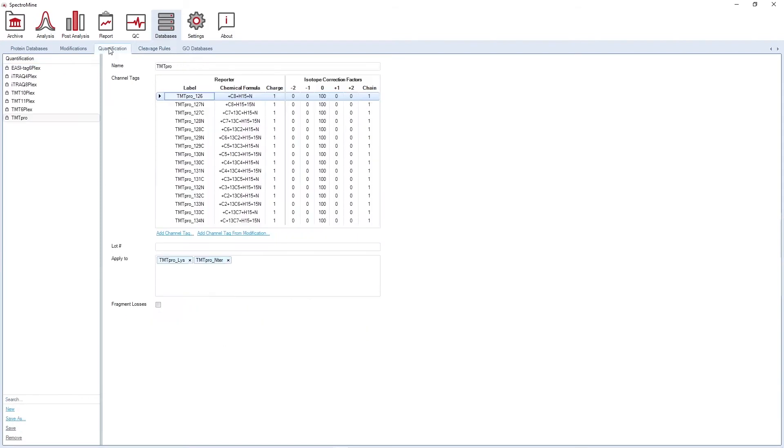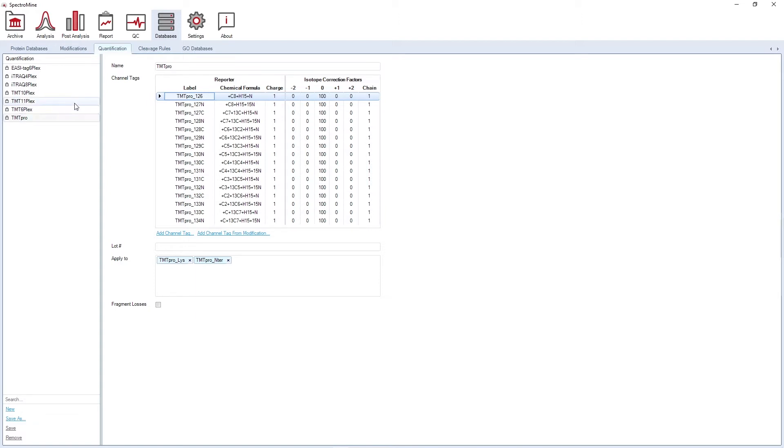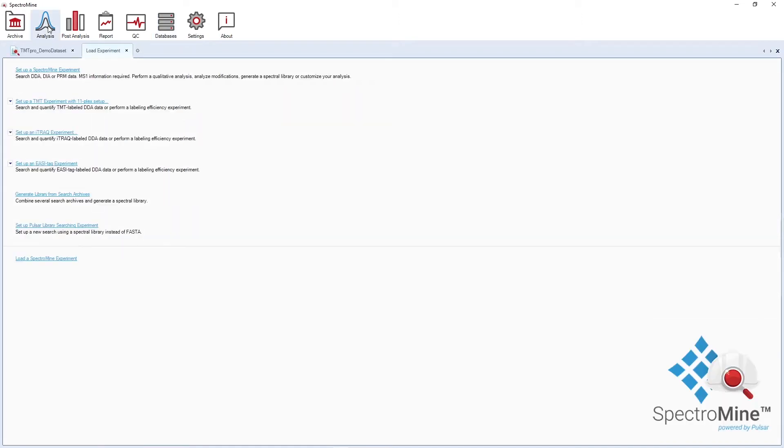Under the quantification tab, you can visualize the quantification method for ILQ quantification. Once you are all set with your parameters and have the resources necessary to start your analysis, you can move to the analysis perspective and start your experiment.